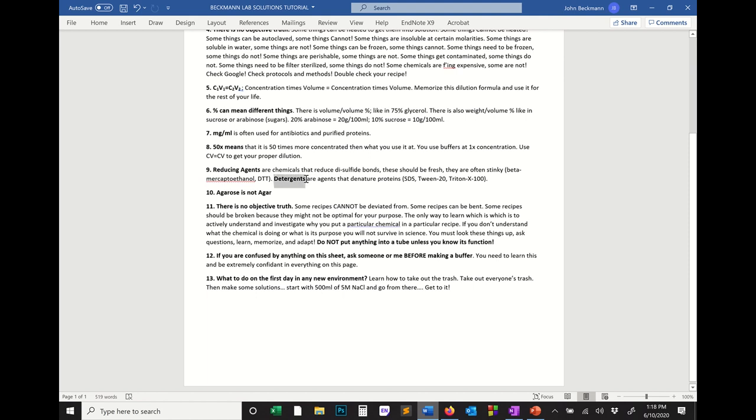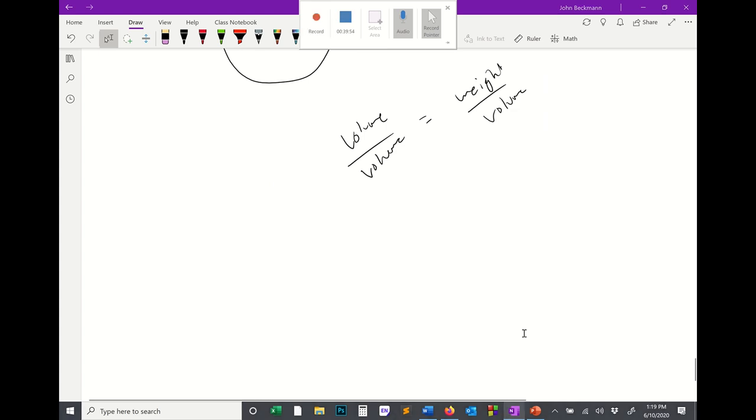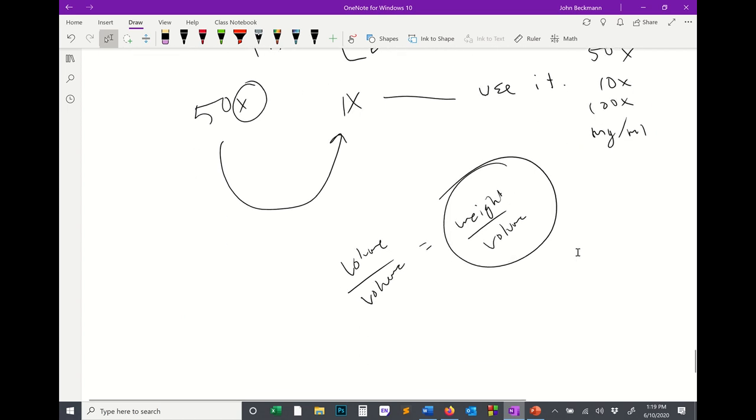You'll also encounter detergents. Detergents are agents that denature proteins. Very, very common detergents in the lab are SDS, sodium dodecyl sulfate, Tween 20, Triton X100. Detergents are very, very viscous. They're hard to pipette. So if you ever need to make a solution of a detergent, you usually use a volume by volume, or sometimes people will use a weight by volume. It depends. The reason they might opt to use a weight by volume is because they're hard to pipette. They're actually hard to suck up into the tube. So they might weigh some out and create a weight by volume percentage because it's practically easier to make the detergent that way.